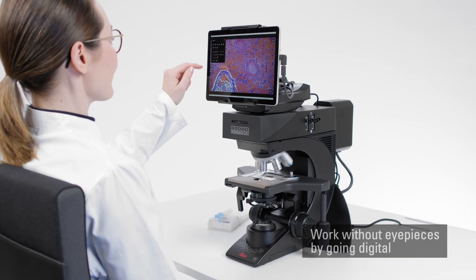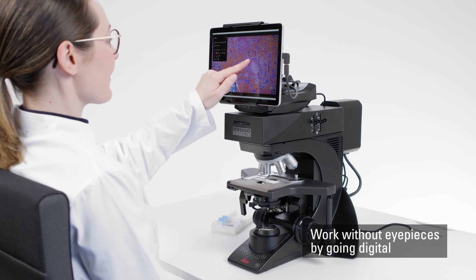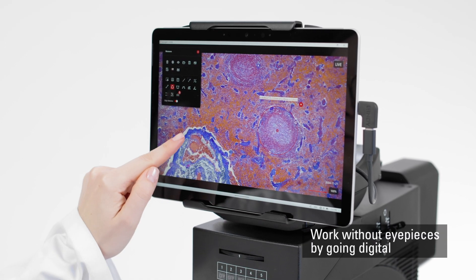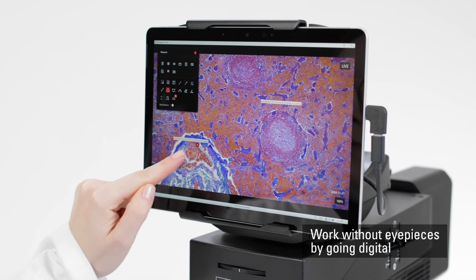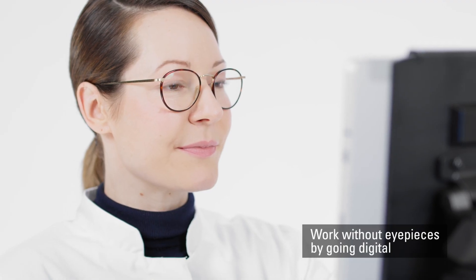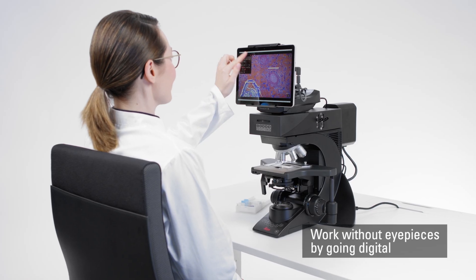If you prefer to work without eyepieces, Visoria B is also available in a digital version. Work comfortably and save space on your bench by operating the microscope without the need for a computer.